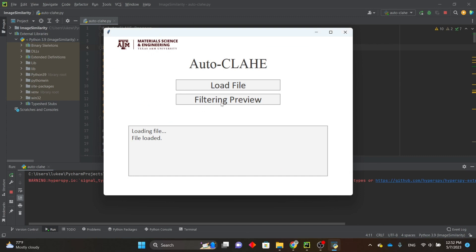Once you have the file loaded, you can click on filtering preview to bring up the preview window. It'll take a few seconds to generate a virtual brightfield image.